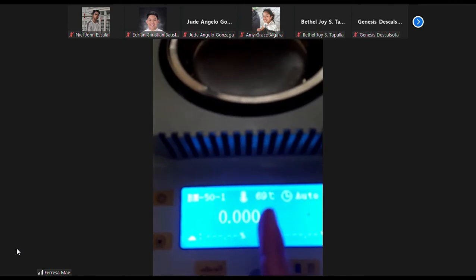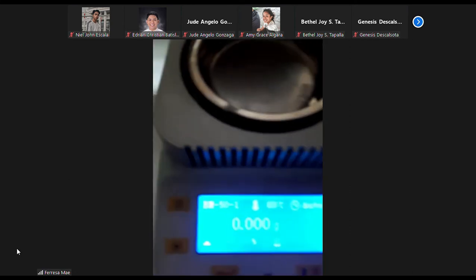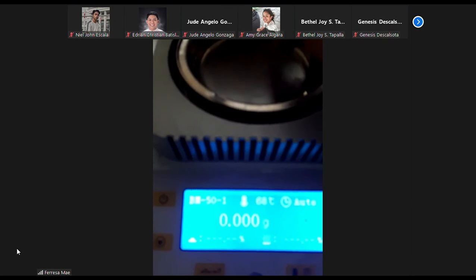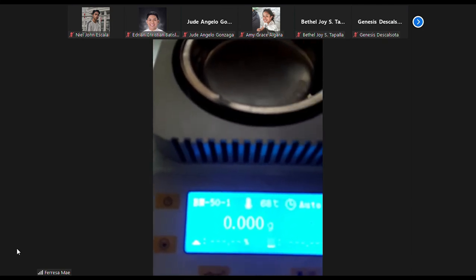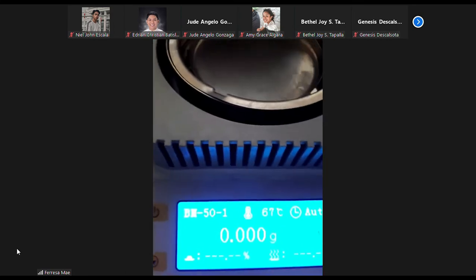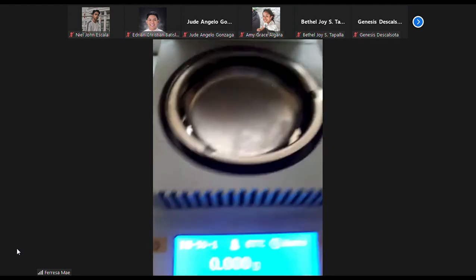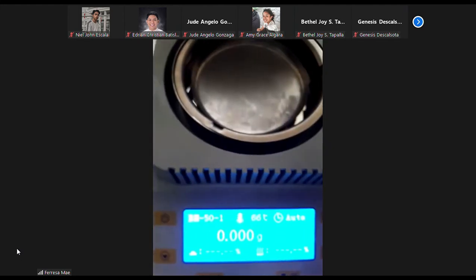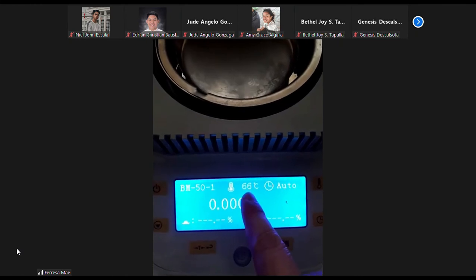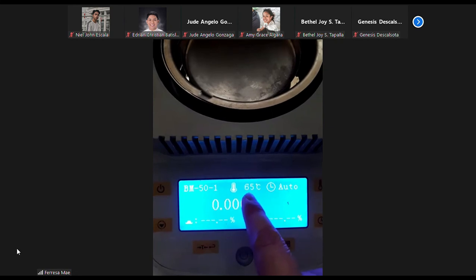Papanaugon pala na ang temp plus, oh. Kay kung butangan yun ng sample nga daan nga wala pa na naog iya temperature, may moisture na na nga makuha. So hindi na nga siya insakto inyo nga makuha nga moisture. Kaya may na loss na moisture nga daan. So ato ni ipa-lower iya temperature sa mga 30 to 40.